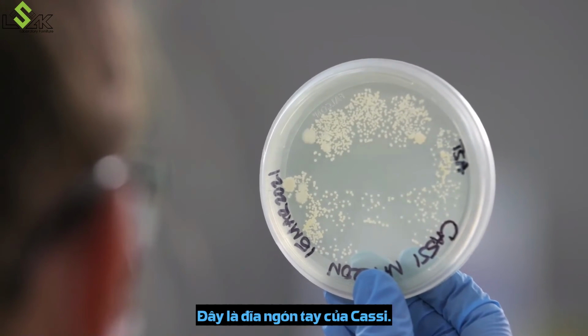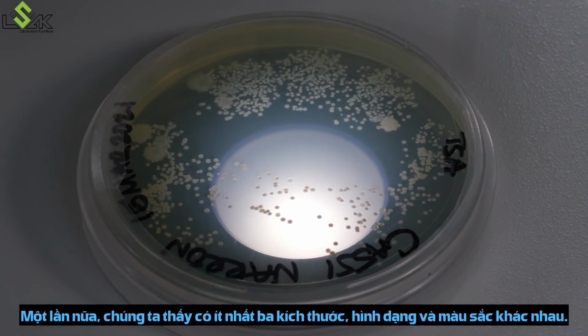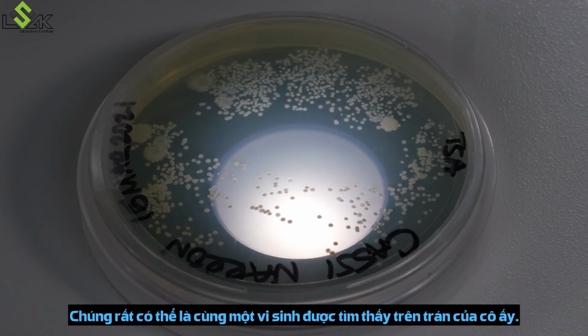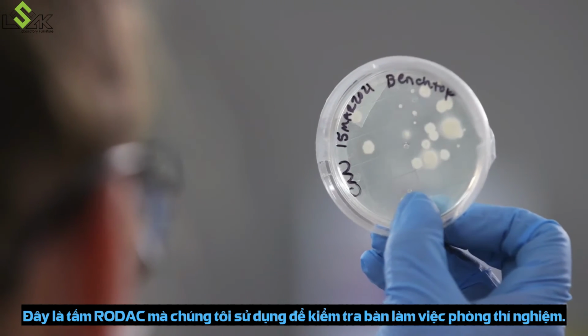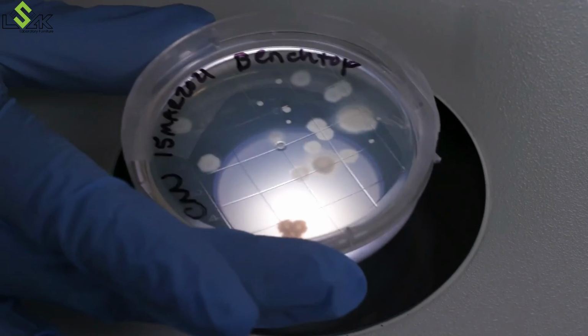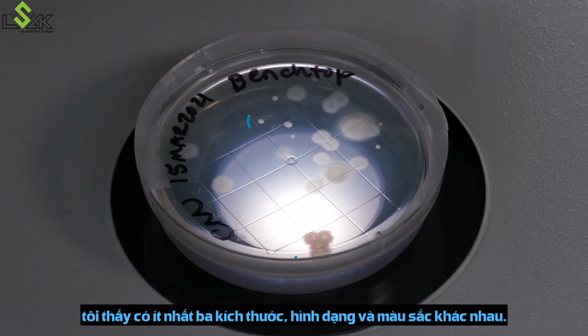Here's Cassie's finger plate. Again, we see there are at least 3 different sizes, shapes, and colors present. They're most likely the same organisms found on her forehead. Many people carry similar organisms as part of their natural flora. Here's the RODAC plate we used to test the lab workbench. I count about 25 colony-forming units, and I see at least 3 different sizes, shapes, and colors present.